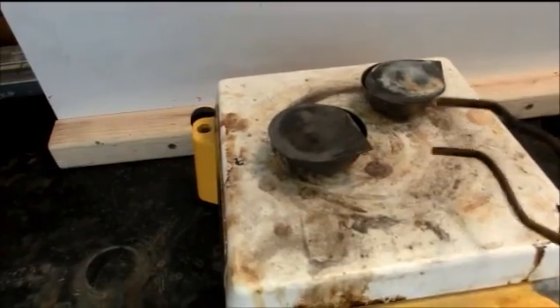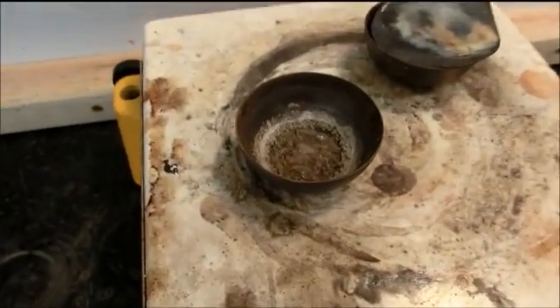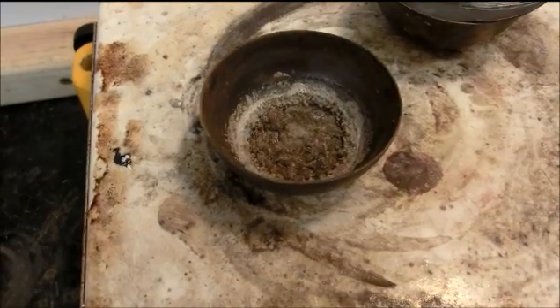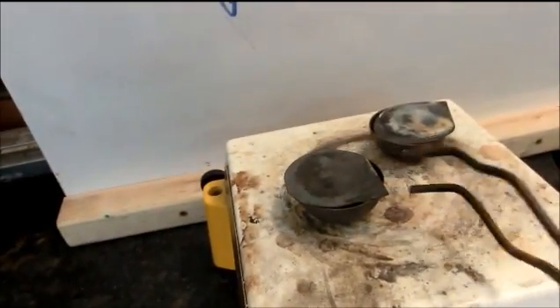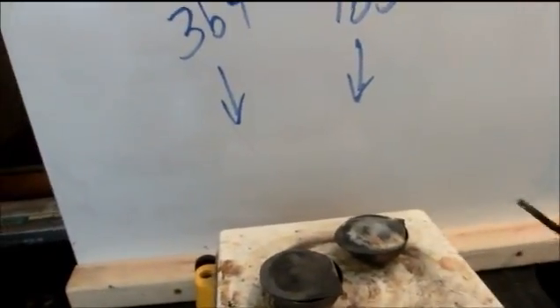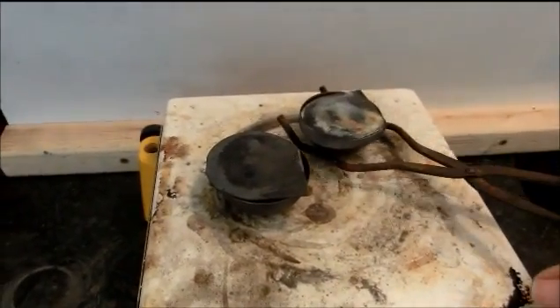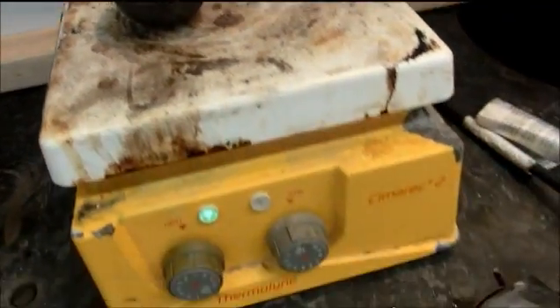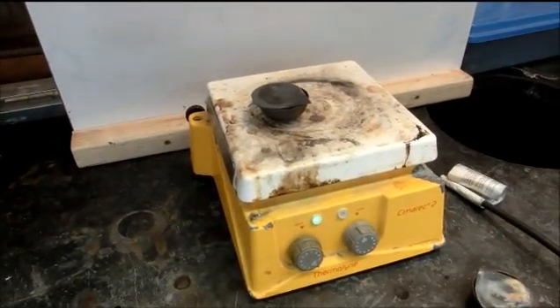Here we are once again. Taking a look on the inside, there is a little bit more bubbling left there, not too much. The other one looks like it has completely stopped bubbling entirely. We are going to go ahead and lift this one off and let it sit on the countertop to cool, and leave the other one to dry for just a few more moments.